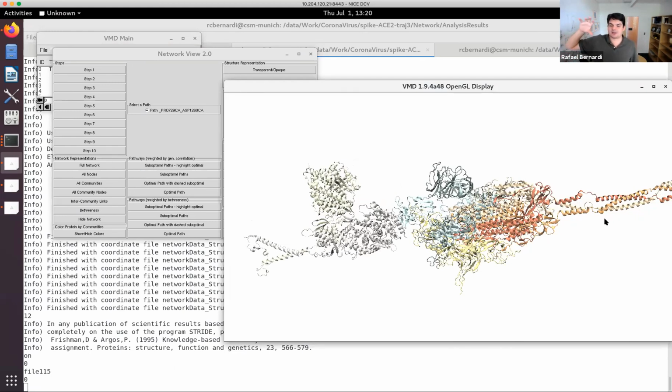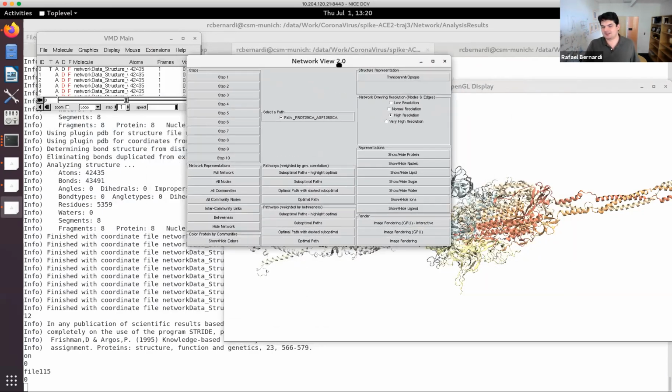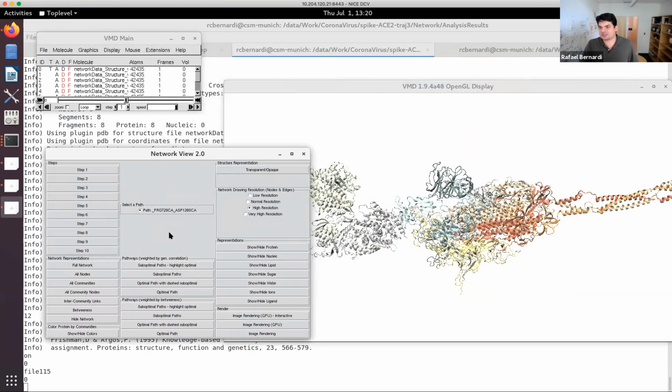So when I'm using Jupyter and I do bar plots for whatever I'm doing there, the bar plots that represent this part of the protein are exactly the same color. All of that you can do, and you can follow our script, it is freely available, you can get it. And now I generated this tool here, and that's a nice thing about VMD. You can easily create your own GUI, see, like this. And this GUI is just changing representations and things like that in VMD.